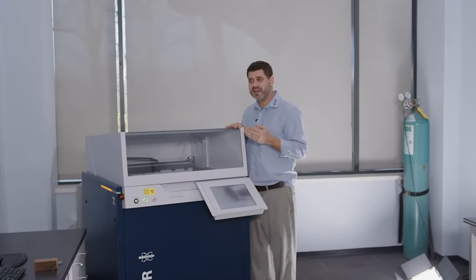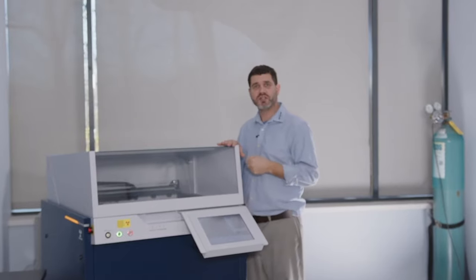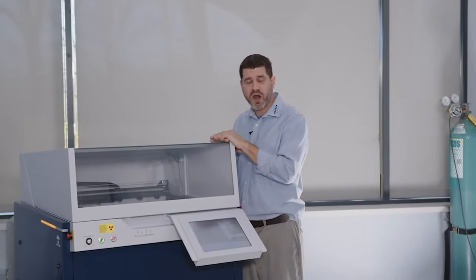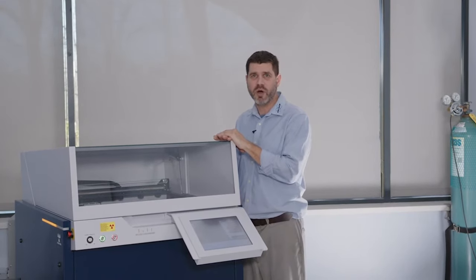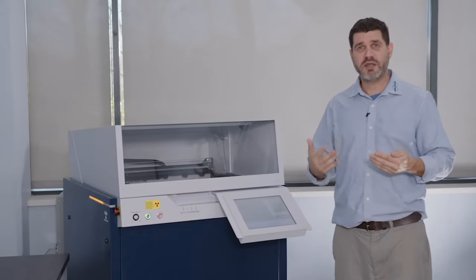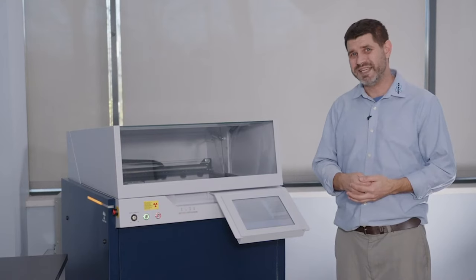What I mean by that is that it has the capability of having more crystals added to it and also more collimators added to it. Also, it's a very powerful unit, which ranges from 1 kilowatt all the way up to 4 kilowatts. Now, I've talked about adding more collimators and more crystals to this, but why would you want to add them? Basically, it's better resolution or more intensity.